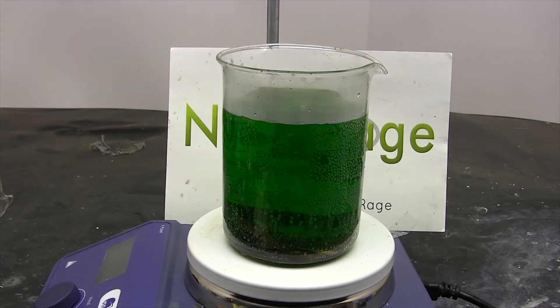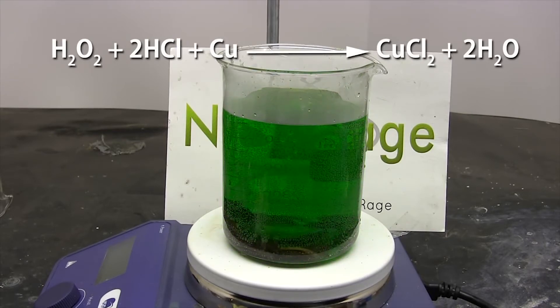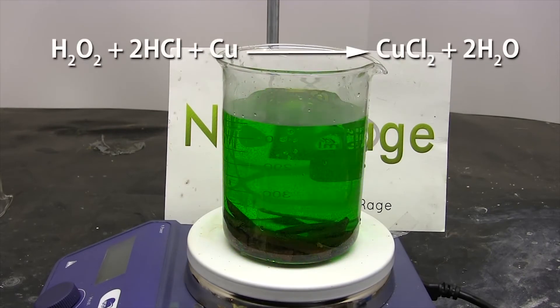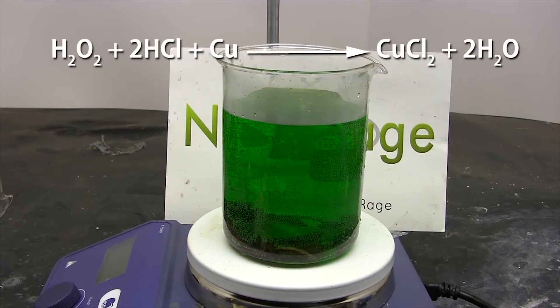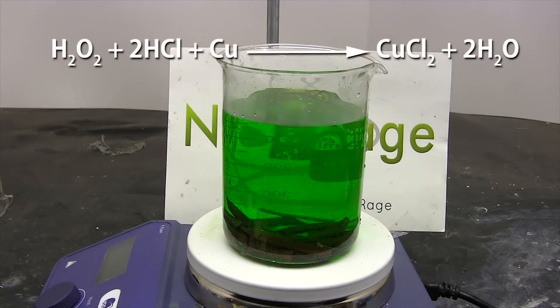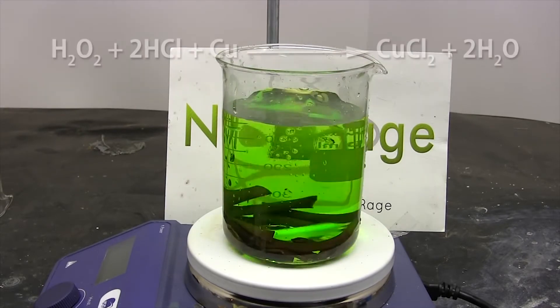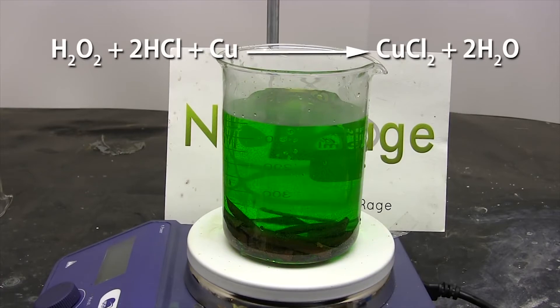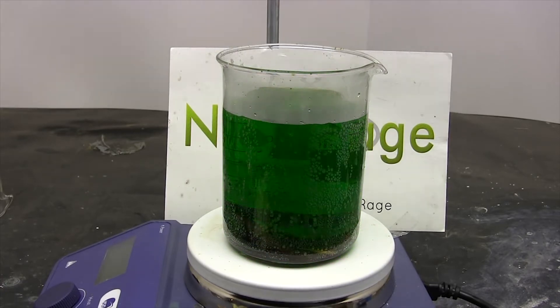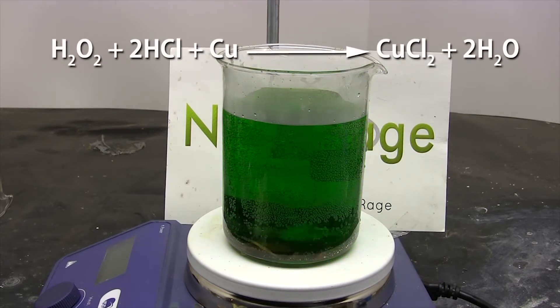Oxidize means you add oxygen. Since hydrogen peroxide is H2O2, it has oxygen in it, so it oxidizes the copper and it reacts with the hydrochloric acid to produce copper chloride. The advantage of this second method is that it is much faster — it takes only a couple of hours to finish, compared to the first method which took several days.